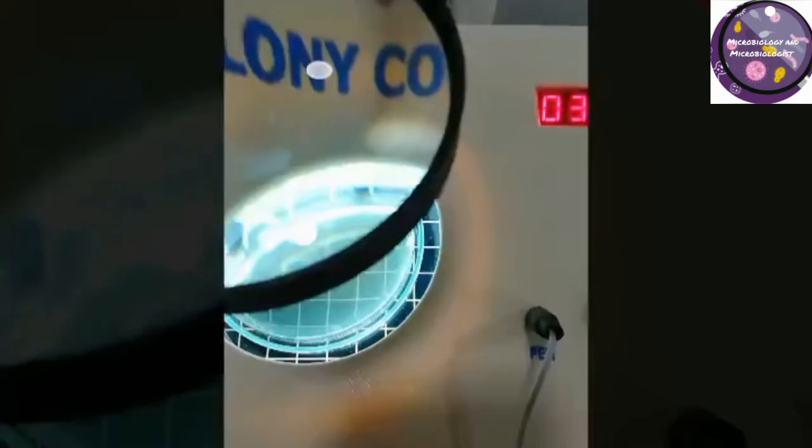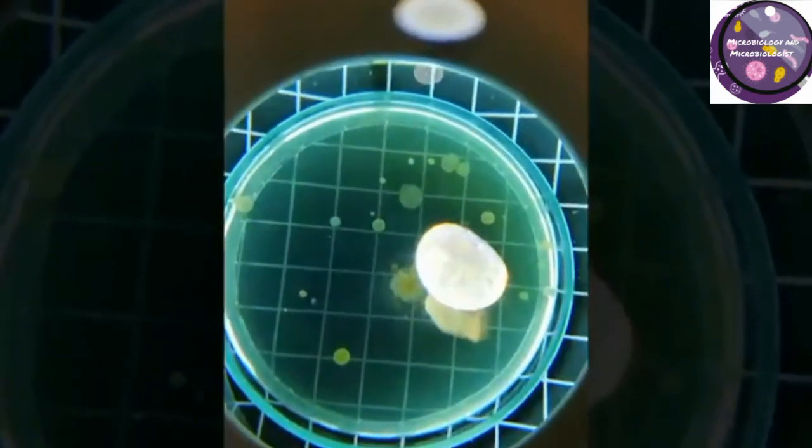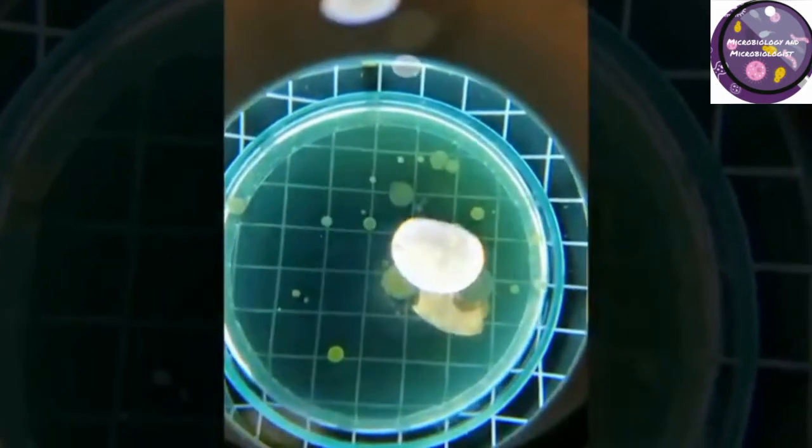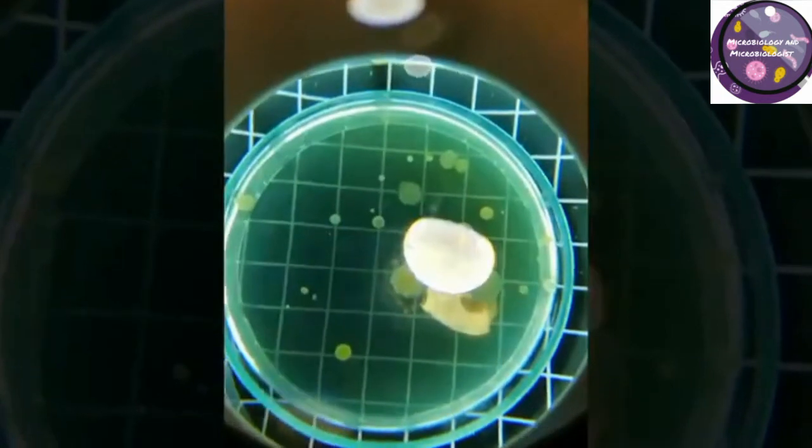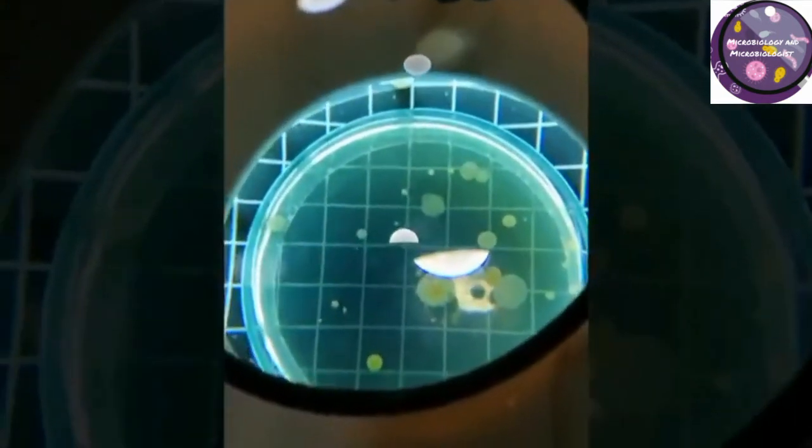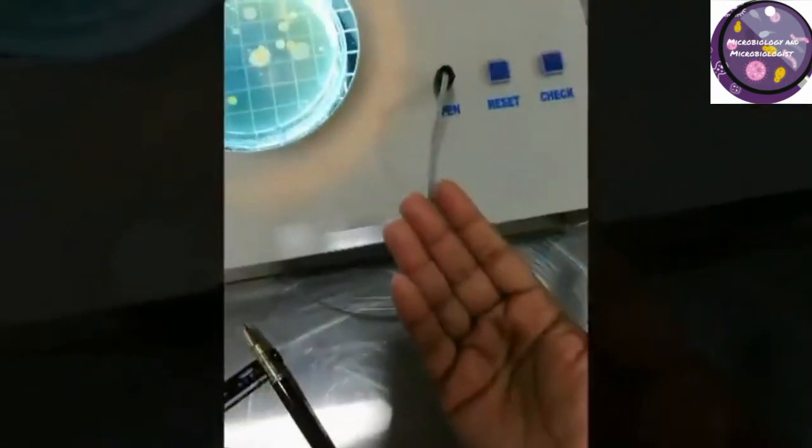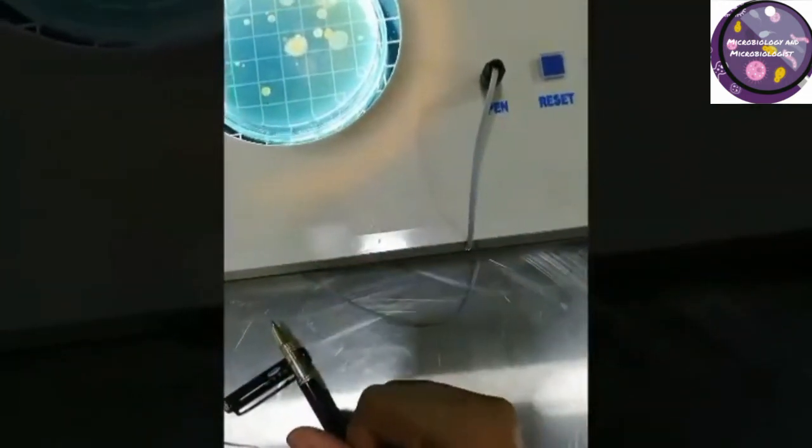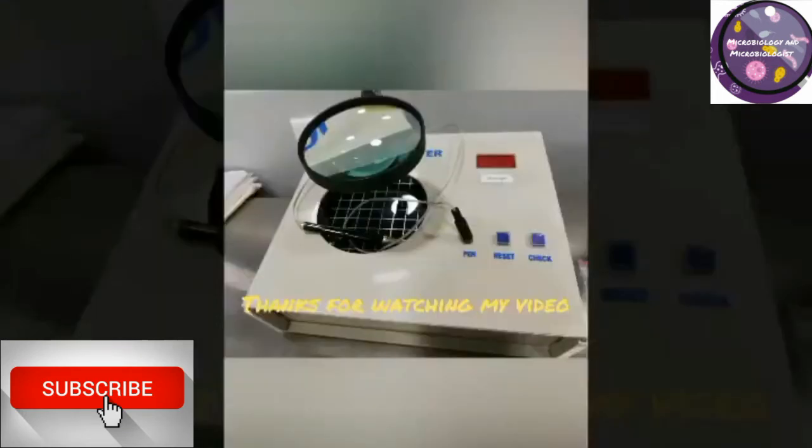This is how I count it, and this is really good, but it is somehow time-consuming. I prefer manual counting. I don't prefer counting by the colony counter because it's taking time. If you can see the colonies properly, you don't need to count with this colony counter, but it's good as well. Please give a thumbs up to my video.